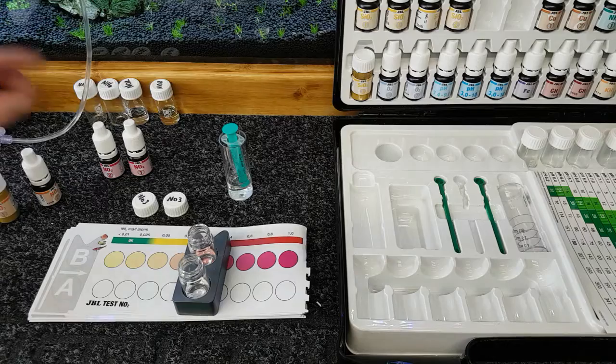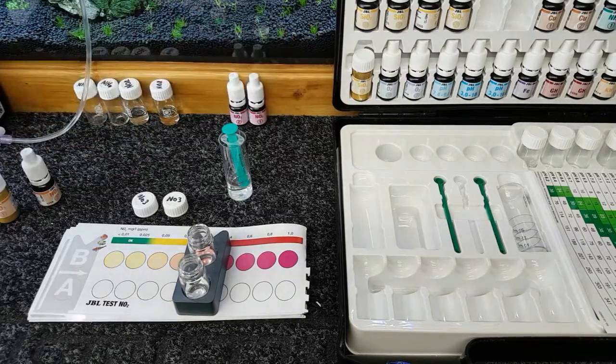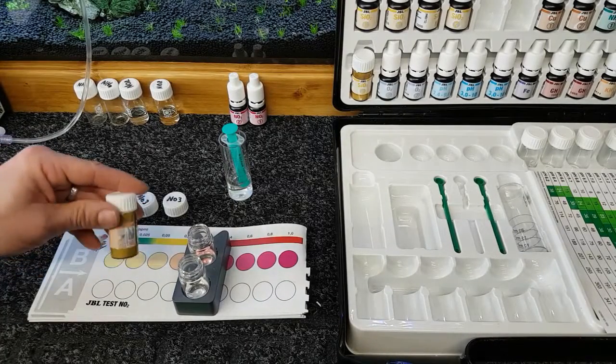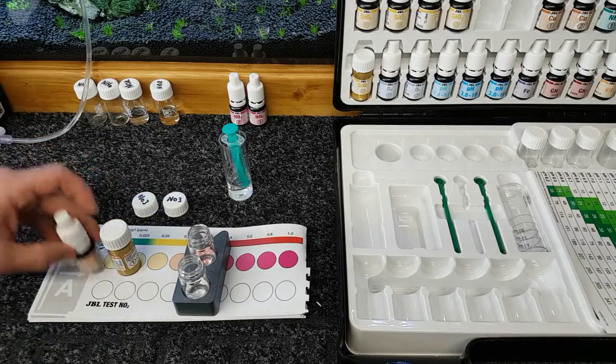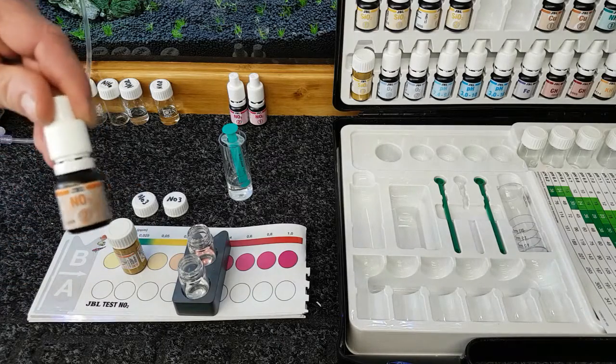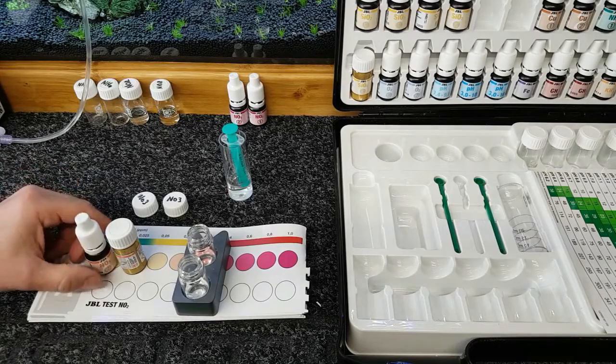So now what we need is a different test this time, so we can put the NO2 for the nitrite test aside. And now what we've got for this one, we've got a powder reagent and the NO3 nitrate reagent there. So we'll shake them up.